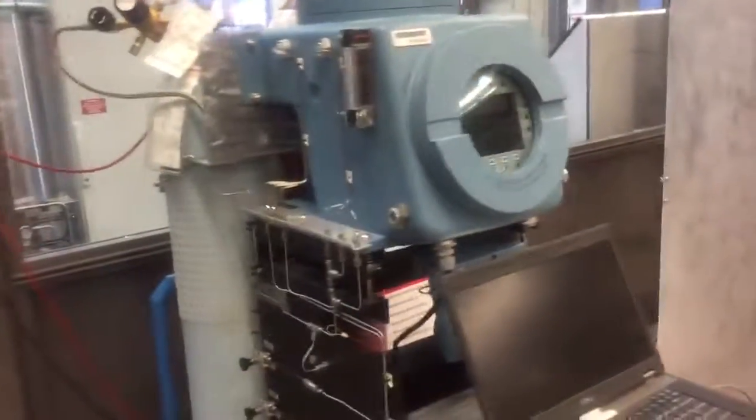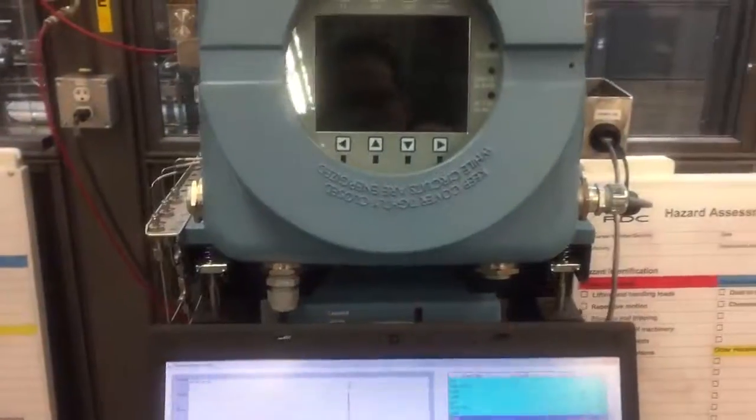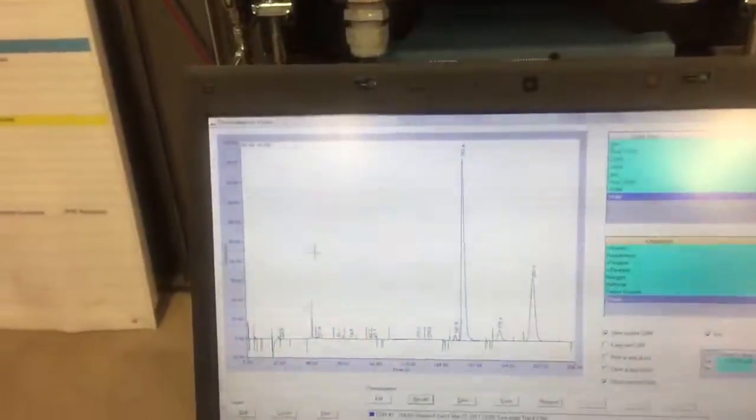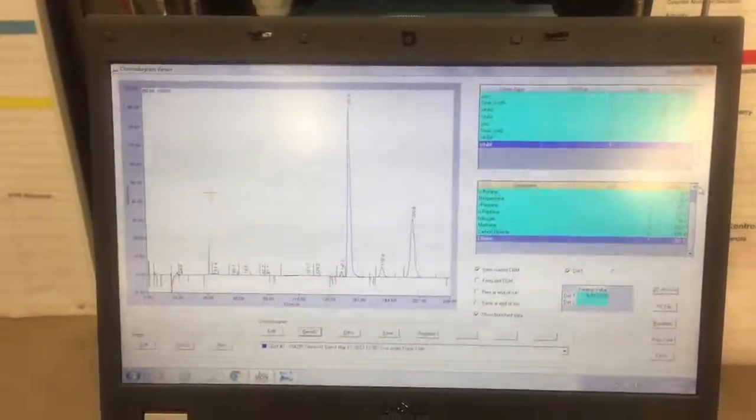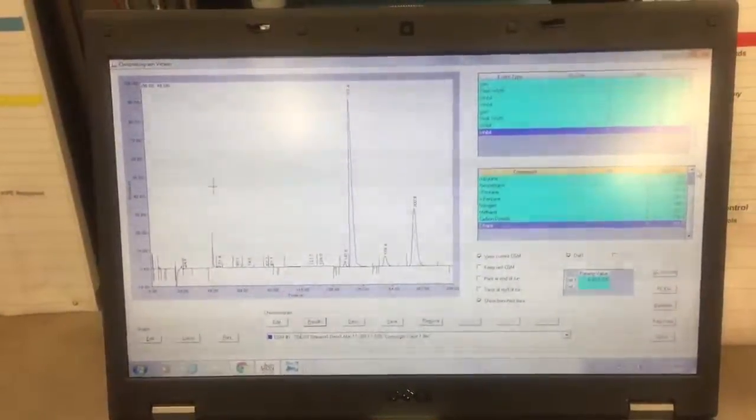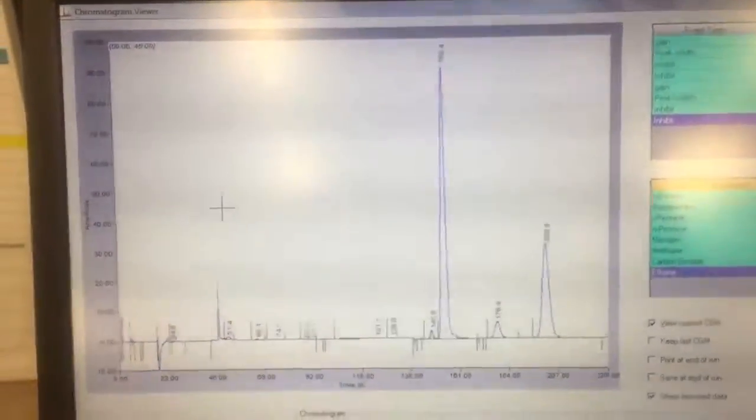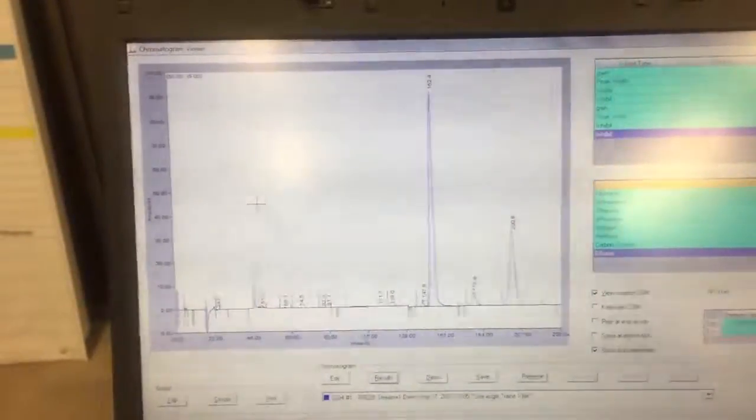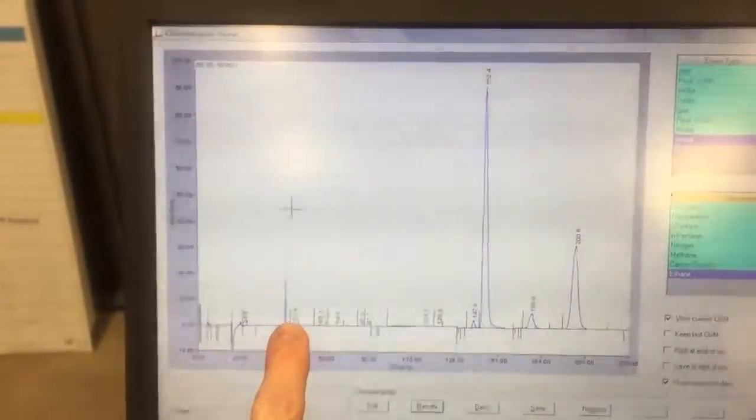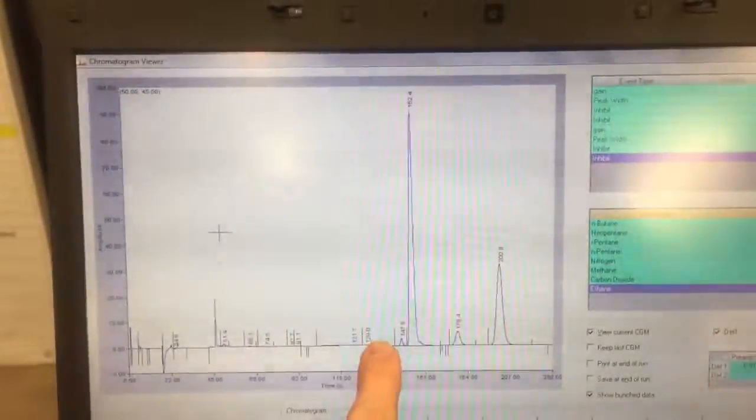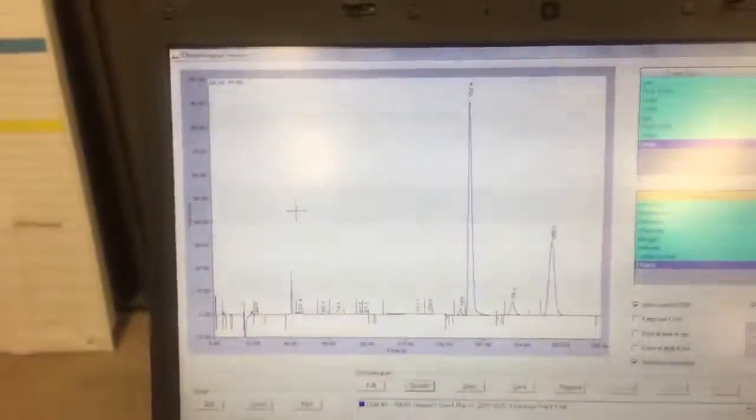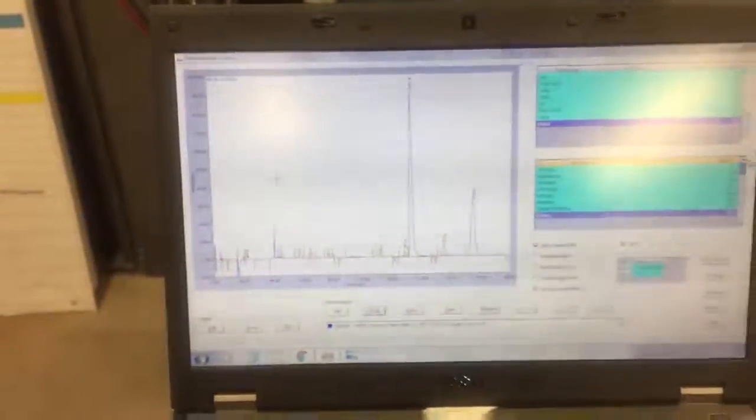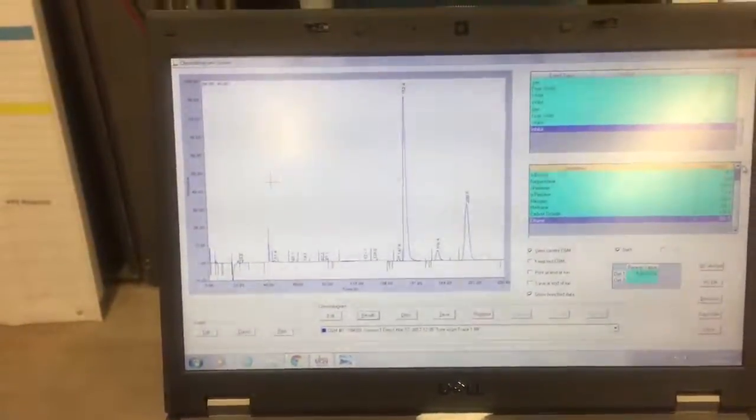One other thing I wanted to show, I just ran a sample of the live natural gas here at the college and here's a picture of the chromatogram. This is the MON 2020 software that's used to interface with the gas chromatograph and you can see right here we've got our chromatogram being produced. This large peak right here is the methane gas. We've got a lot of methane gas in our natural gas. When you do the lab, when you look at the calibration gas, you'll see a lot of things showing up here because the calibration gas has a lot of components in it, whereas the actual natural gas only has maybe three. These three right here are the most prevalent or have the highest concentration in the natural gas, and when you do the lab, you'll find out what those are.